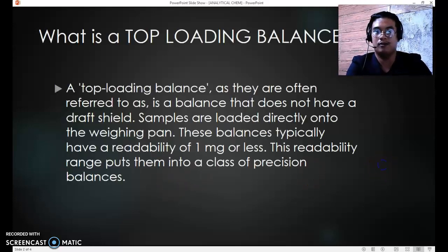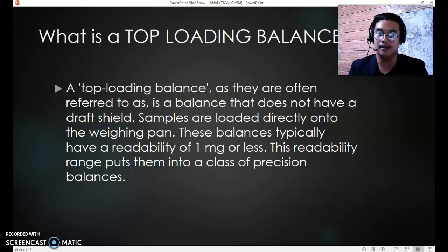So first, what is a top loading balance? A top loading balance, as they are often referred to, is a balance that does not have a draft shield, unlike an analytical balance which has a draft shield. The draft shield is used for preventing the balance pan from moving.